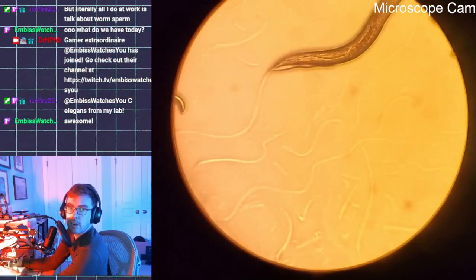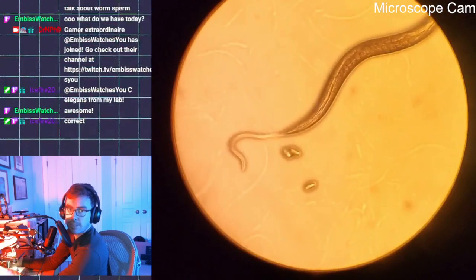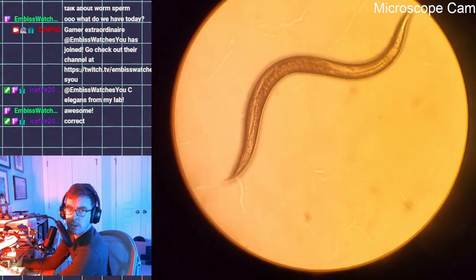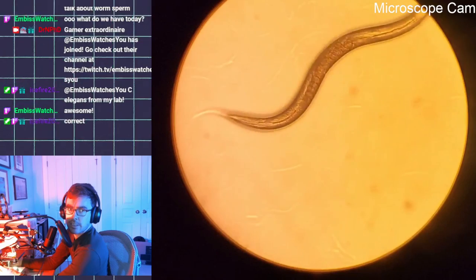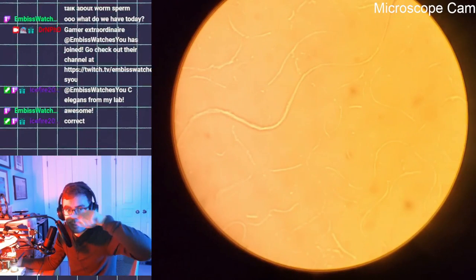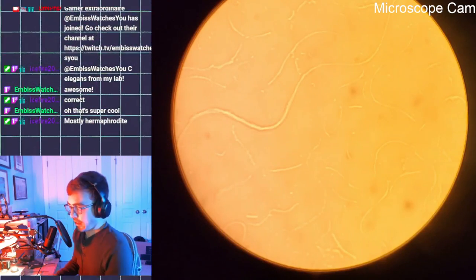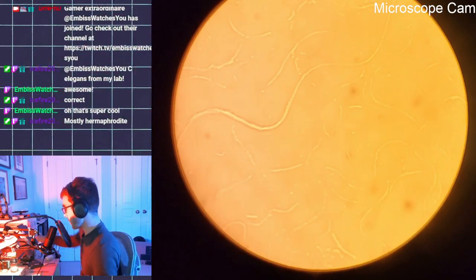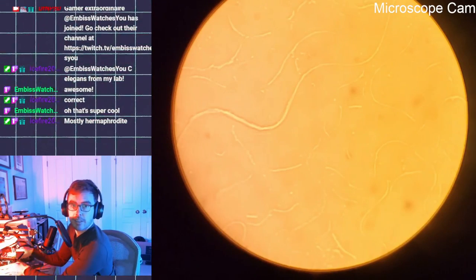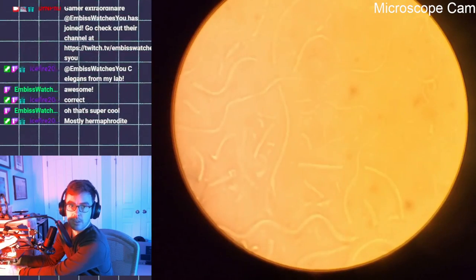So they are either hermaphrodite or male. So if I see big cells on one side, then the sperm have to be on the other. The sperm aren't too big, are they? Because it's like male gametes go around one end, female around the other. Yeah, now I'm just trying to catch some of them to get them under a slide so I can paralyze them and look at them even more closely. They're mostly hermaphroditic. Okay.